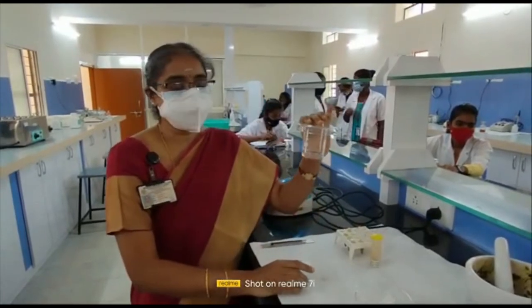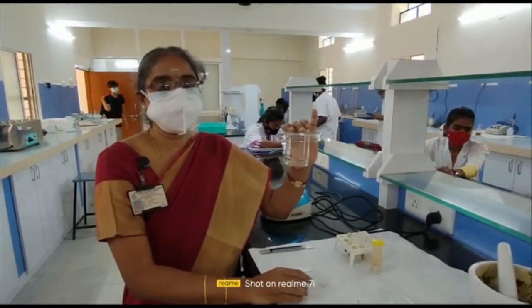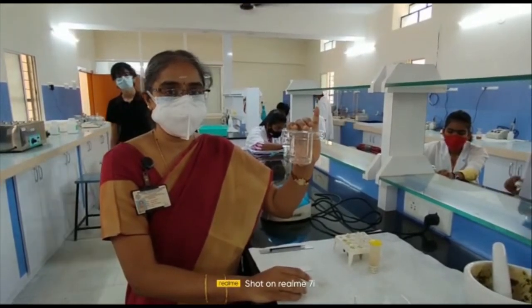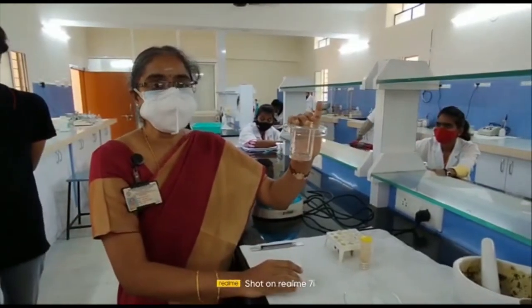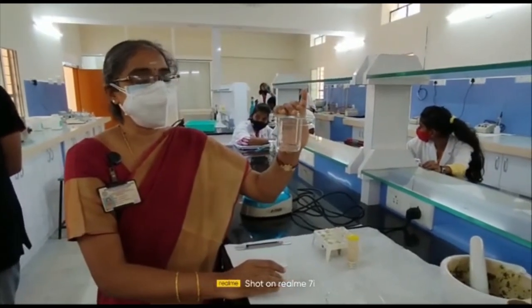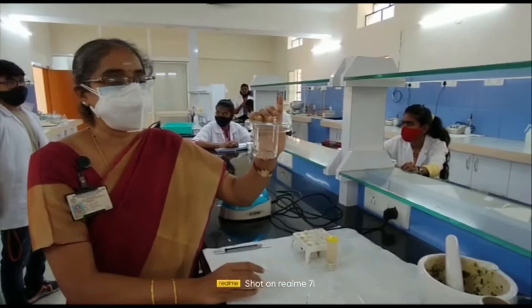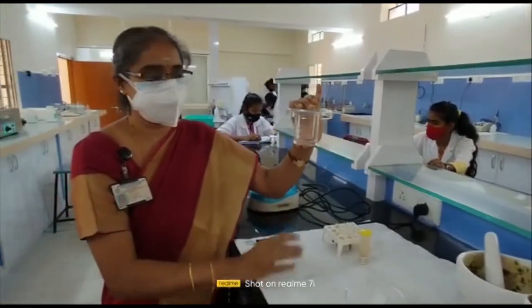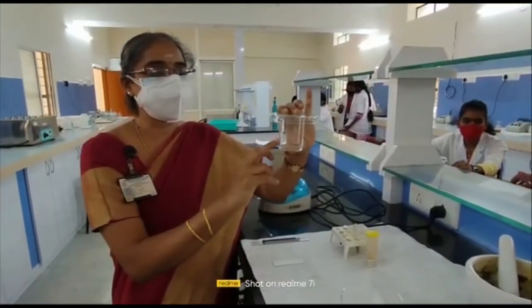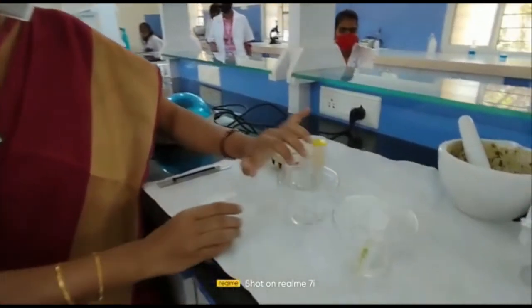For the mobile phase, we use benzene and acetone in the ratio of 9:1. Remember: for thin layer chromatography to separate plant pigments, the mobile phase is benzene and acetone in the ratio of 9:1. We transfer the mobile phase into the TLC chamber — a 100 ml beaker covered with a petri dish — to allow saturation. The three steps so far are: preparing the TLC plate, preparation of the sample, and saturation of the chamber with the mobile phase.